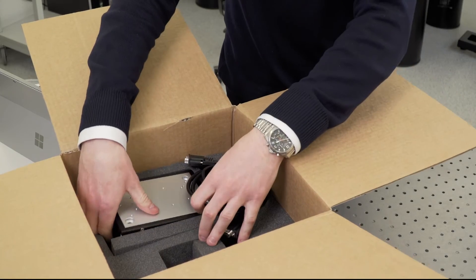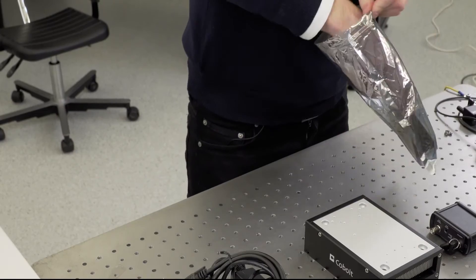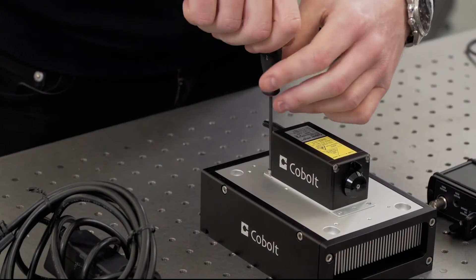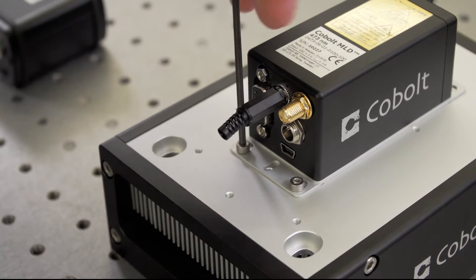or DPL, diode pump laser, the first thing you need to do is to take the laser head out of the EZ-T protective bag and mount it onto the heat sink. It's important to have it mounted onto a heat sink to prevent overheating.